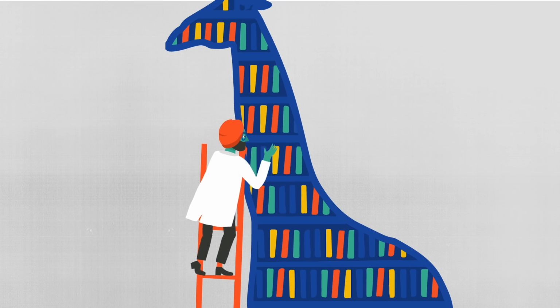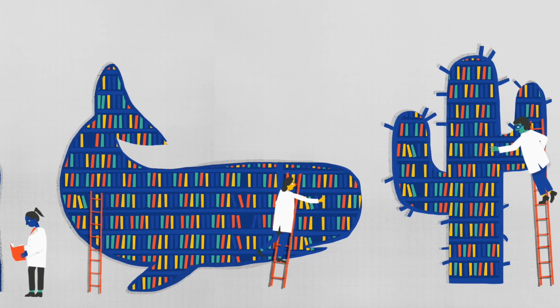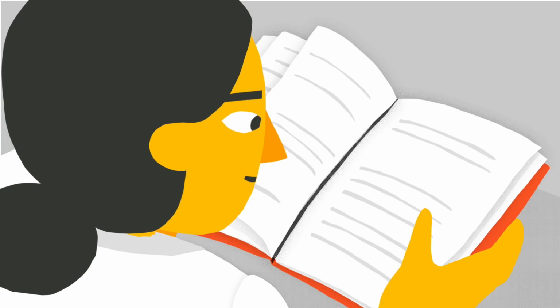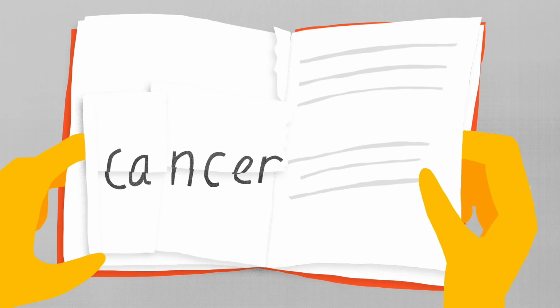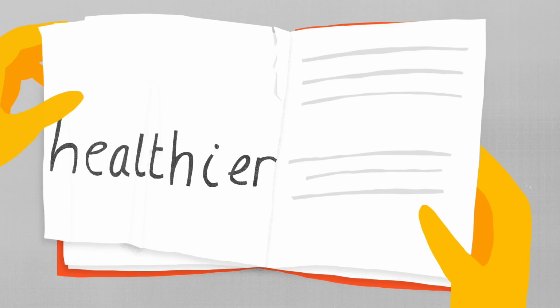not just in humans. From animals to plant life, DNA exists in the cells of every living thing, and this method can be used to read it all. And while it can be used to detect unwanted mutations that make species more susceptible to certain diseases, it can also identify the mutations that make them hardier, healthier, more productive.